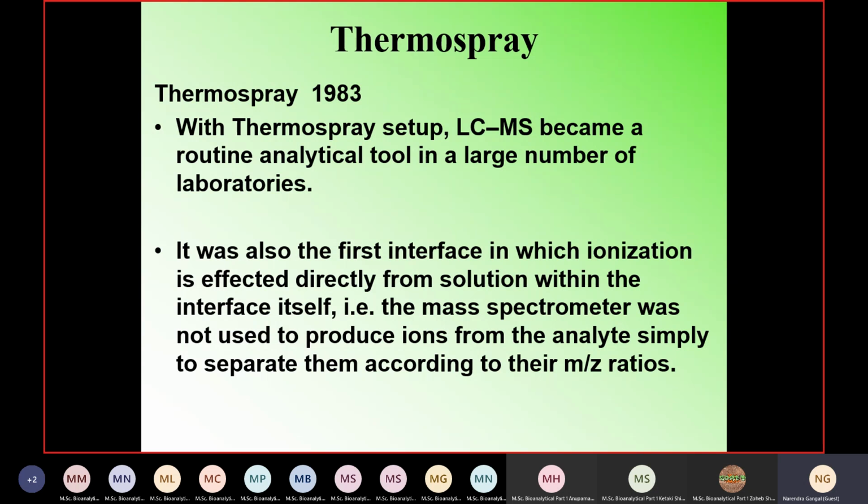So that is why LCMS took little time, because interfacing the liquid chromatography with a mass spectrometer was the most difficult thing, because it has to take care of the load of liquid. That is why, as compared to the conventional LC, today UPLCs are preferred for LCMS, because the flow rates are very very small.